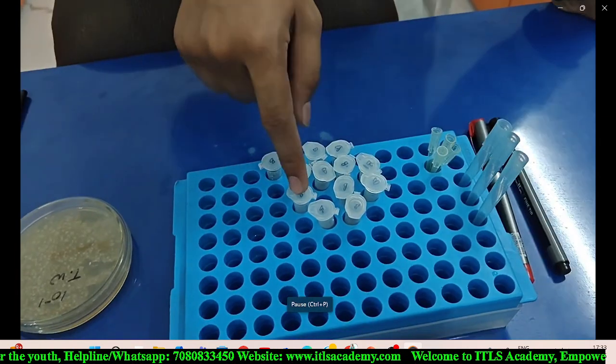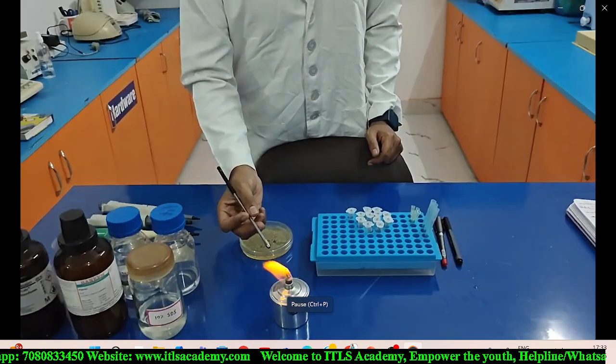See, B is indicating that we are extracting the DNA from bacterial cell. Now with the help of inoculating loop, I'm going to extract the bacteria from our culture and pour it into the Eppendorf for making culture broth. So by the same procedure, we need to fill all the 12 Eppendorf, and after that we need to centrifuge all these Eppendorf at 3000 rpm for 10 minutes.